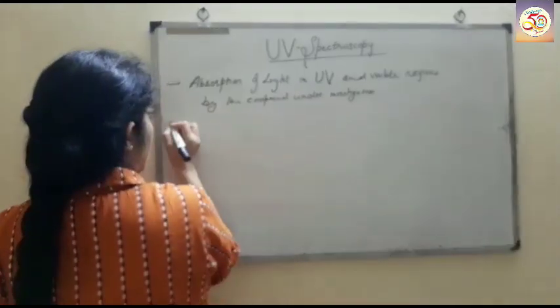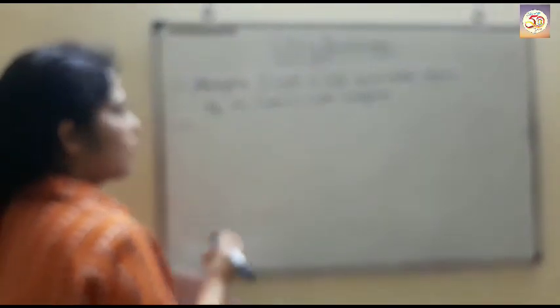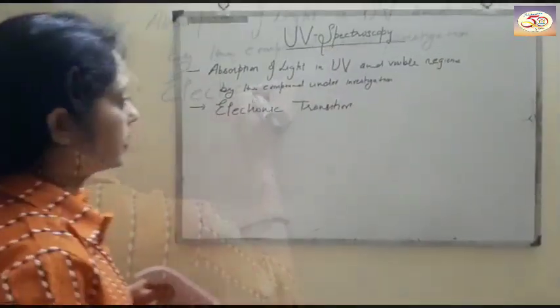As in our previous section, we have studied that UV spectroscopy causes electronic transition within the molecule.